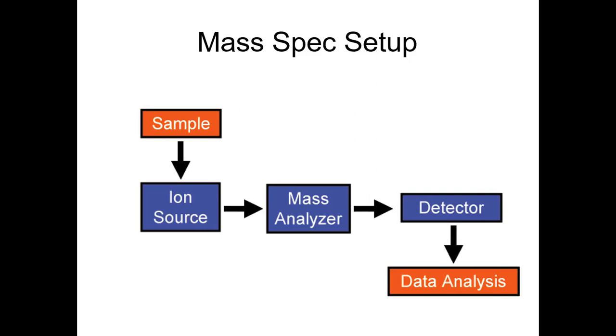Right, so this is the basic layout and the basic operation of a mass spec. Now, the instrument itself is way more complicated. The mass spec that we have at Tuskegee, I think, cost us roughly $500,000 or $600,000. It's a QTOF, which is a time of flight mass spec, and it has a long tube that points up toward the ceiling. And so basically all your fragments get beat up, they get ejected into this tube, and as they fall, you're able to calculate the mass based on the time of flight, right?